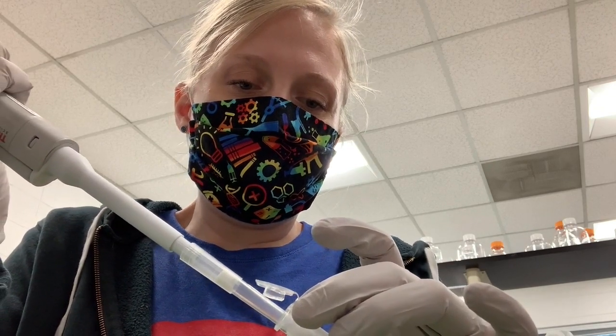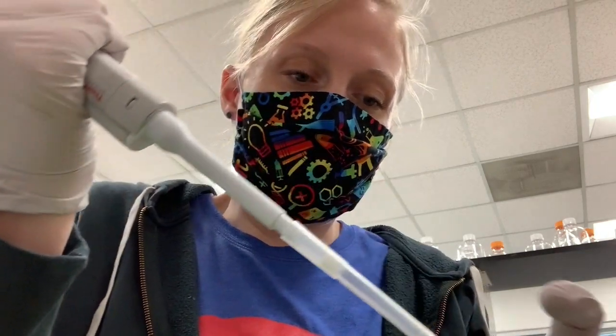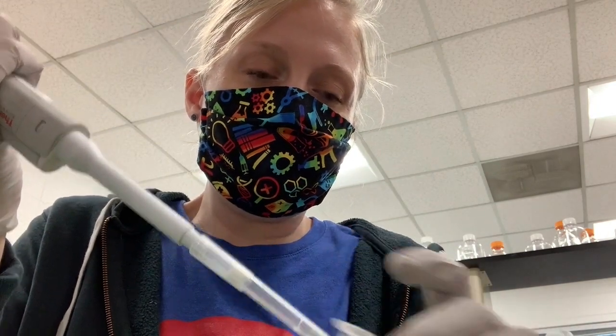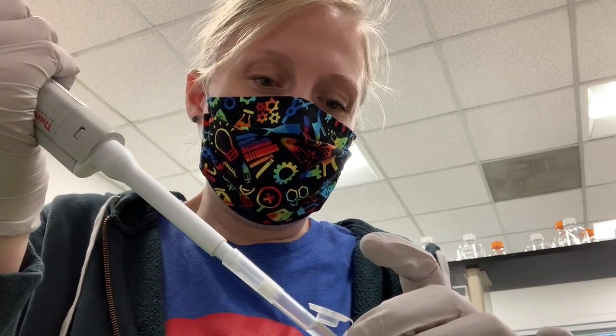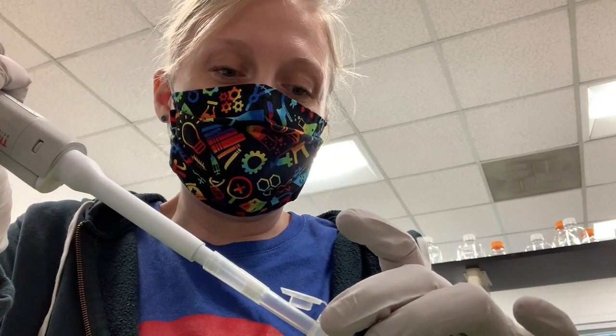For those of you who have done riboprobe synthesis before double-stranded RNA synthesis, riboprobe synthesis causes a very small white pellet, like almost invisible. So if you've gotten used to that first, this double-stranded RNA pellet will be really big and impressive by comparison. In contrast, if you're doing this first and then you're going to do riboprobe synthesis later, the pellet will probably be much smaller for that.